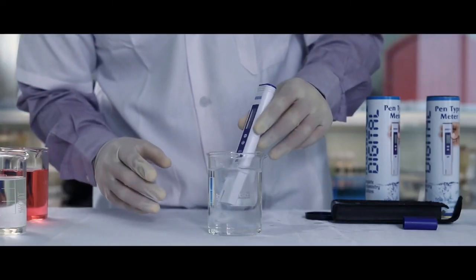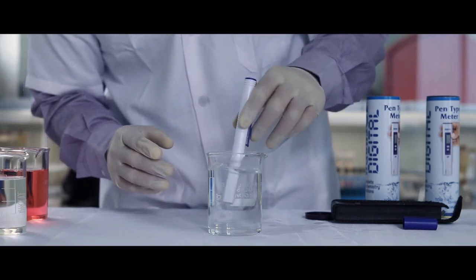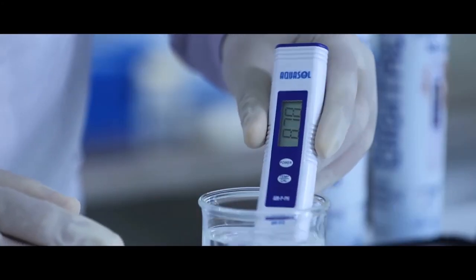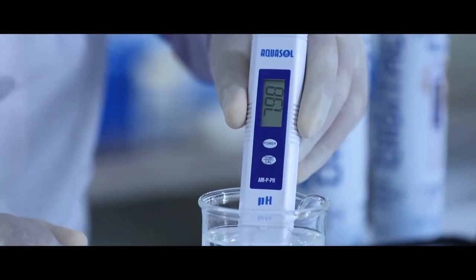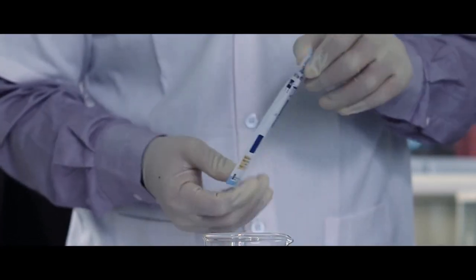To test the pH value, dip the electrode in the sample solution. Stir gently to a stable reading. Press the hold key to note down the reading. Please refer to the impact leaflet for more details.